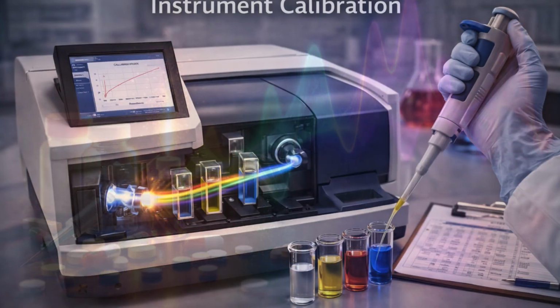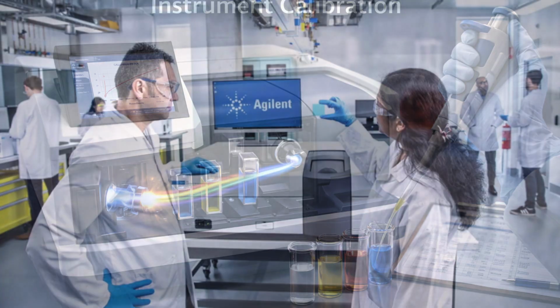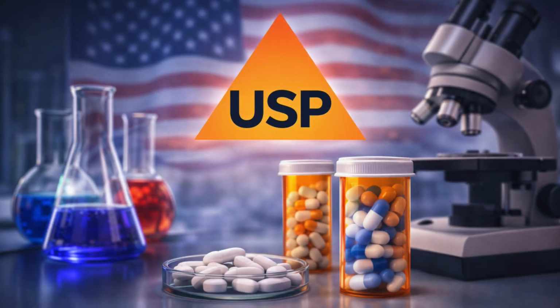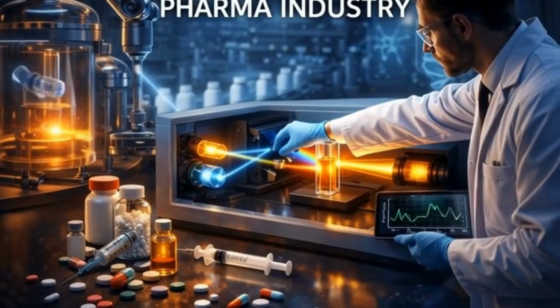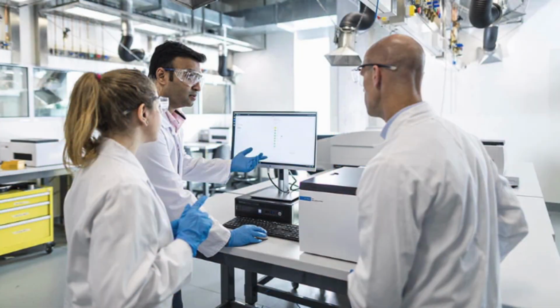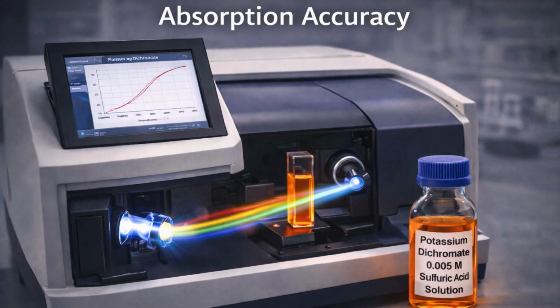Coming to calibration and system suitability, it plays a very important role for the instrument. USP strongly emphasizes instrument calibration. The parameters we check for calibration: wavelength accuracy using holmium oxide, and photometric accuracy using potassium dichromate solution.